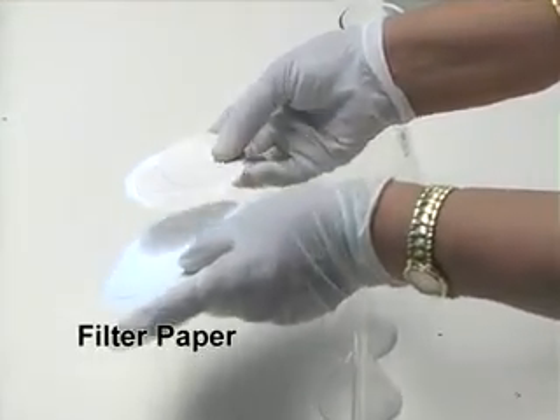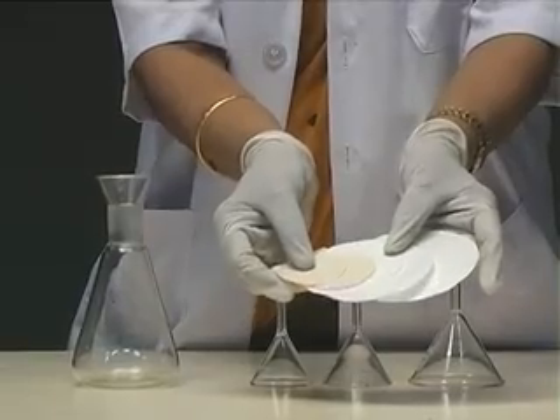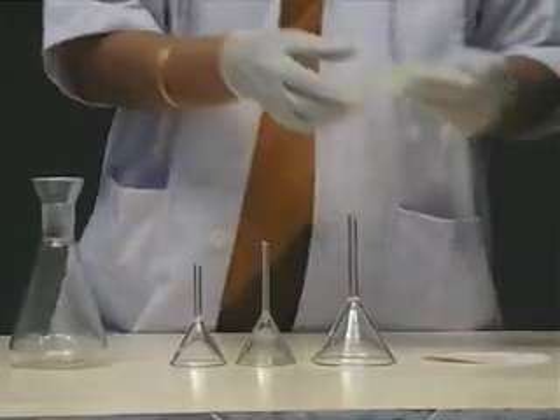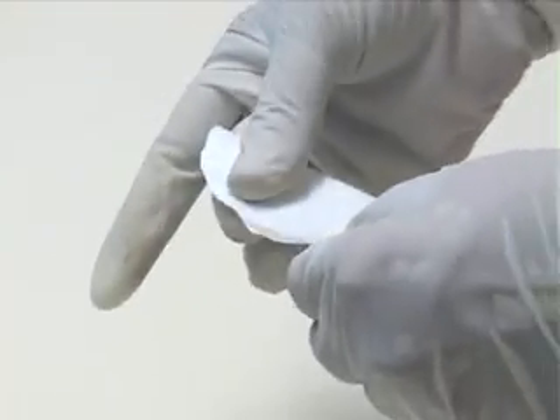Filter paper is available in different sizes and also with different pore sizes. To use them, first make a 4-fold so that it can be opened as a cone using one of the sides.